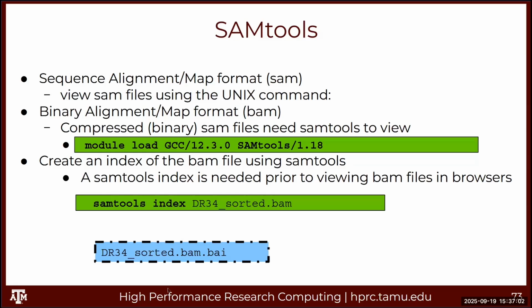So type that first line in. You can type in the second line.